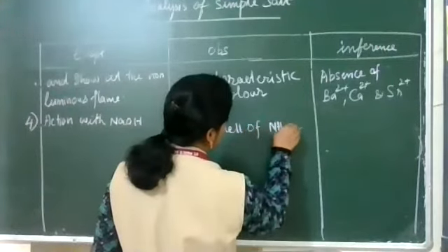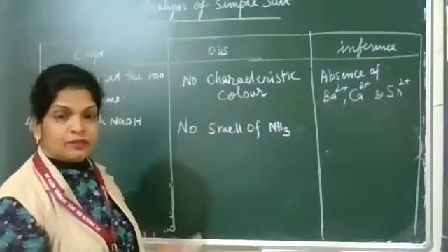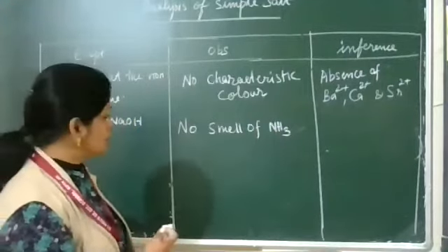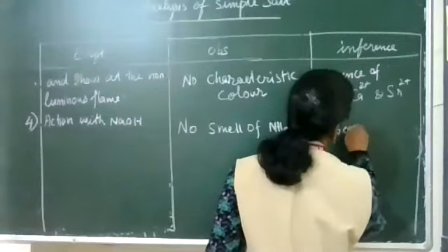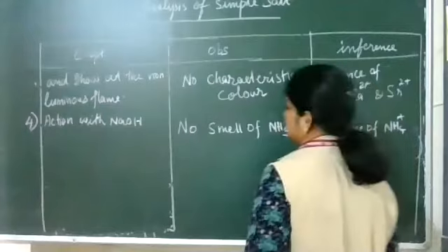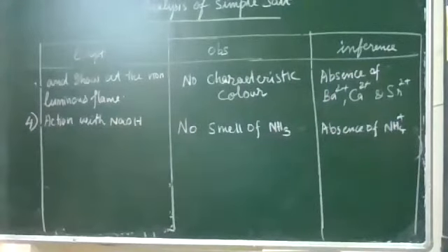If you get the smell of ammonia, you write: smell of ammonia, presence of NH4+. Now here, no smell of ammonia, so we write absence of NH4+.